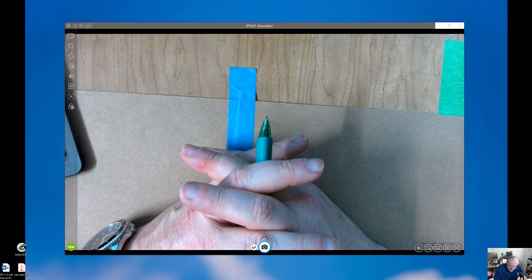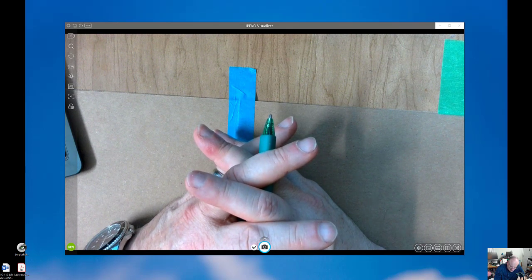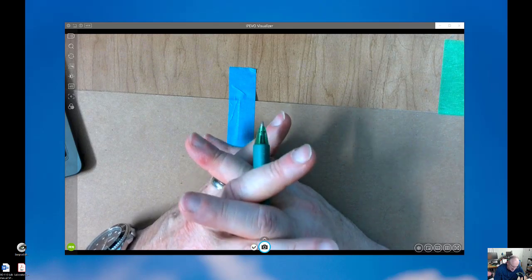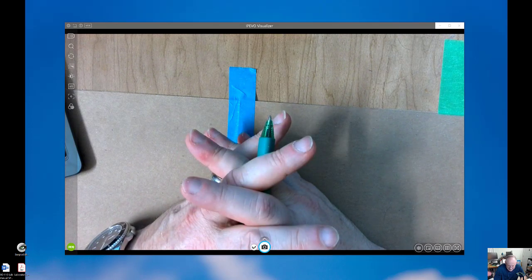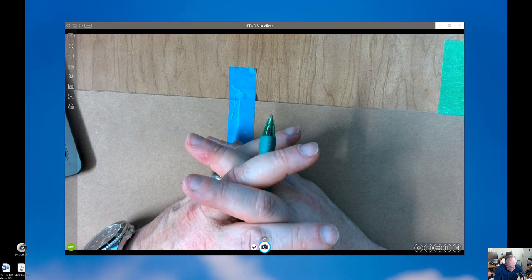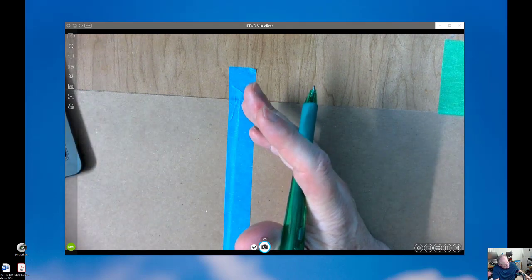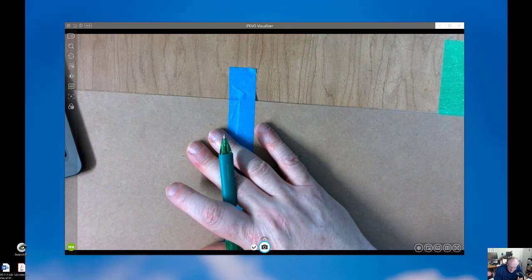The actual implementation, we had gone over enough that you know how to inoculate aseptically in a tube, and all we're doing is stabs and streaks and things like that. So I feel like you probably have the technique to do it. I'm not worried about that. But the hard part is the head wrapping, or understanding what you're doing, and that's the key piece. There are enough resources, I think I put in the directory here, that you can use. You can talk to each other on Teams if you want. I don't have a problem with that. Share information, whatever you want to do, and collaboration as we get through this.